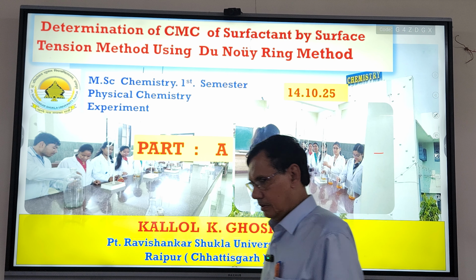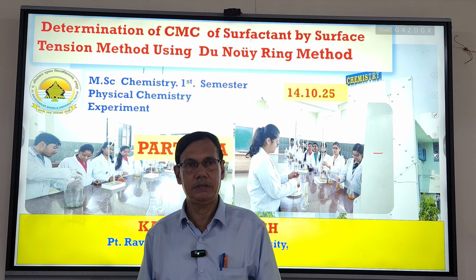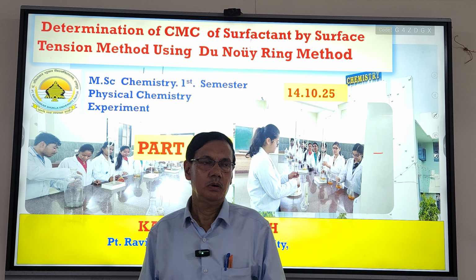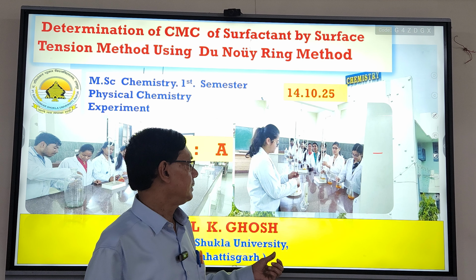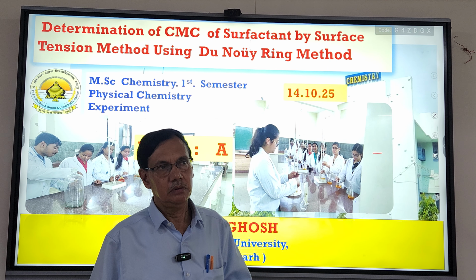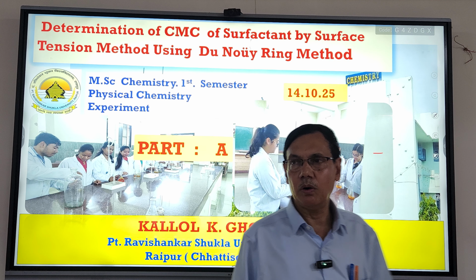Fortunately, our department has a very sophisticated tensiometer. I will explain gradually. So we will perform this experiment with that tensiometer.